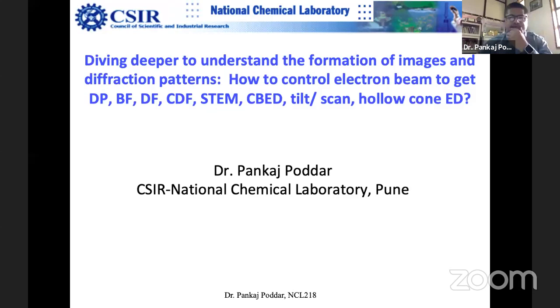So today, as I promised, we will dive much deeper into how the images and diffraction patterns are formed, and how to control the electron beam to form diffraction pattern, bright field, dark field, center dark field. We are going to understand why we need center dark field, and we'll also learn STEM, scanning transmission electron microscopy.